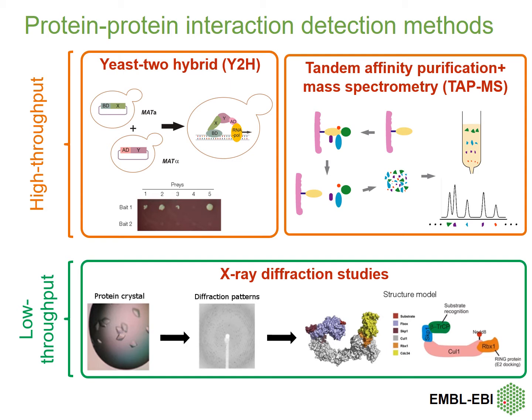And here's a protein attached to an affinity column, and then you do this under conditions where its partners interact. You can then break these partners up and analyze them by mass spec. So that's what's going on here. So all these different proteins are being analyzed. So you can take any protein and figure that out at that snapshot in time.